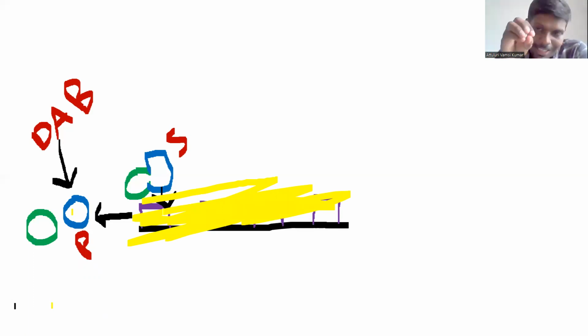Now, this enzyme histochemistry will give us two kinds of data. One is qualitative data, either the presence or absence of a particular enzyme in the tissue. And the second one is the quantity of the enzyme present in the tissue.